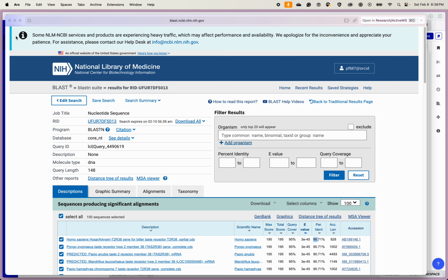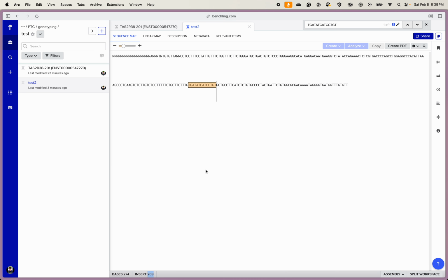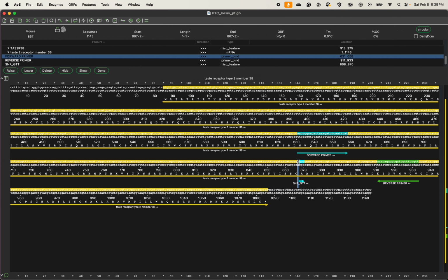All right, this was a pop-up, so I can close this. Now we can go back. Let's keep it in APE, Benchling is going to be too long. So what we can do is the same kind of thing. Let's see if we can search around.